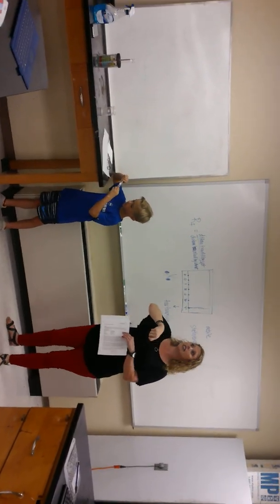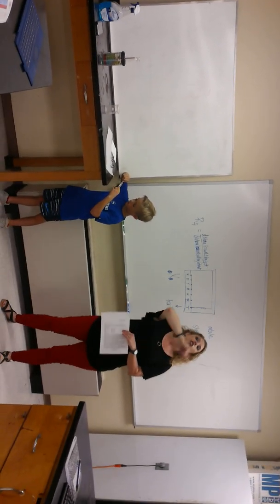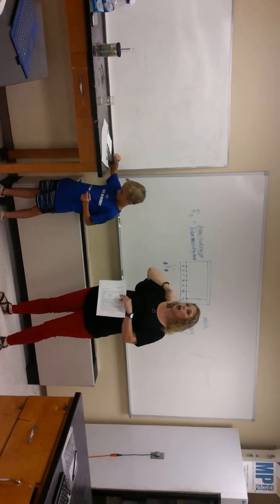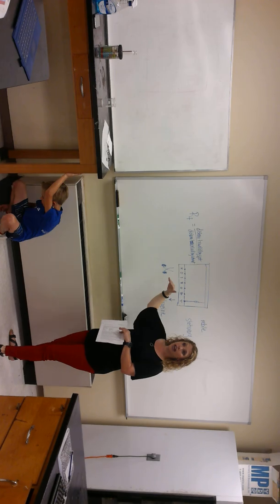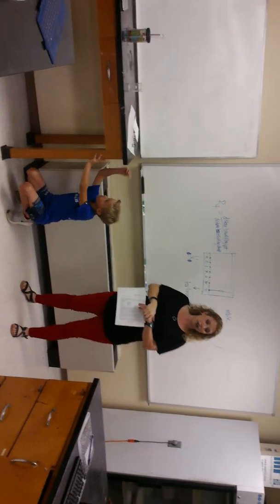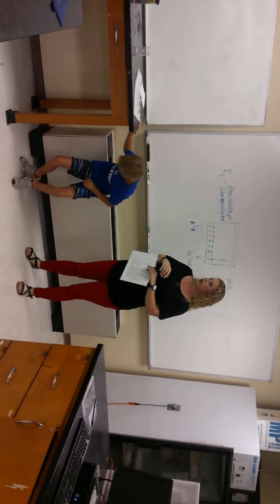If you do that, let's say that you do that in the green one, you've got to rinse your stirring rod off with distilled water before you put it in another, because if you don't, you're contaminating. And you're going to see those colors elsewhere. So be very careful with that, okay?